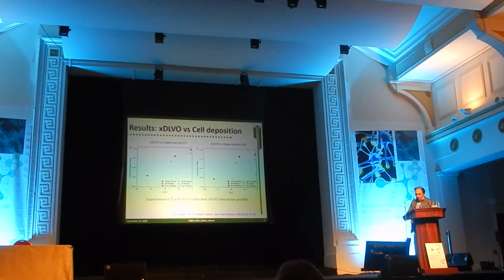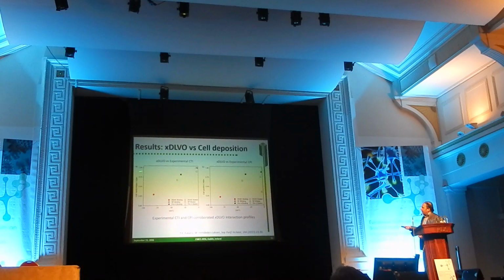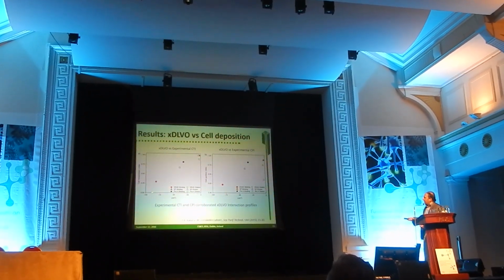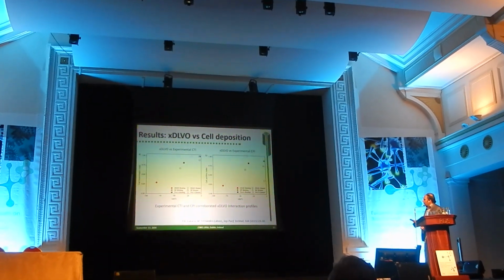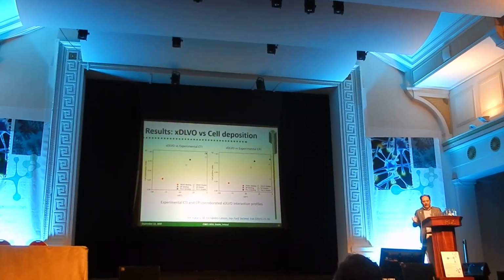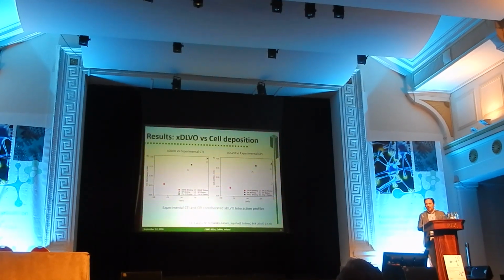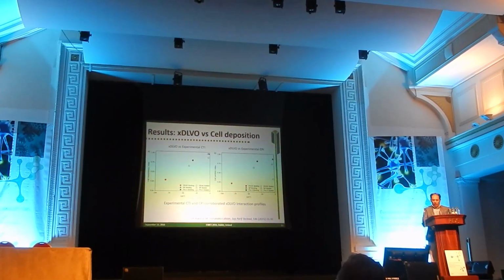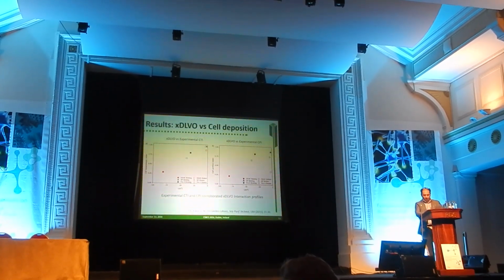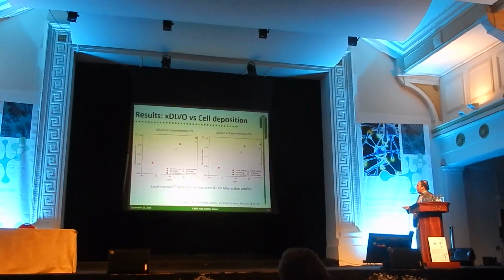So, a correlation between the energies of interaction on this side here and the cell transmission index or the cell partition index on this side actually provides a nice correlation, in this case also for mammalian cells. I'm showing relatively simple graphs here, but we have many publications indicating that this is actually the case when we work with different types of biomasses, and especially yeast and bacteria. So this corroborates the general applicability of the approach.